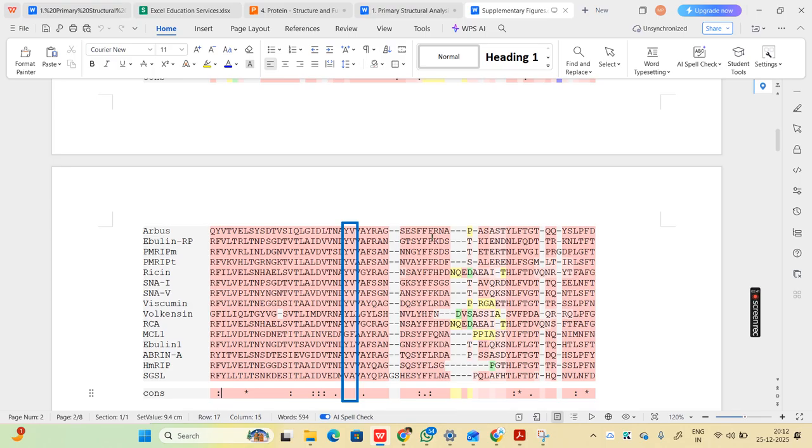And you can see here we have all F's, and in between there is only one H. Phenylalanine is aromatic, we all know, and histidine is not aromatic but it has pi electrons, like it has the ring structure, and you can see it is represented with a dot. And whenever it is blank, it means that region is not conserved.